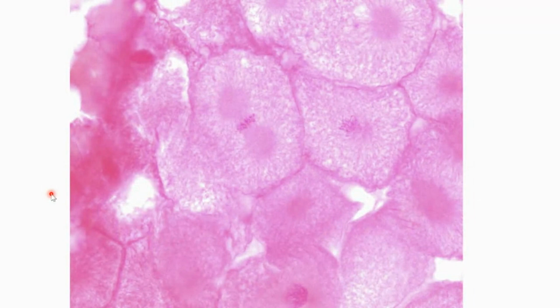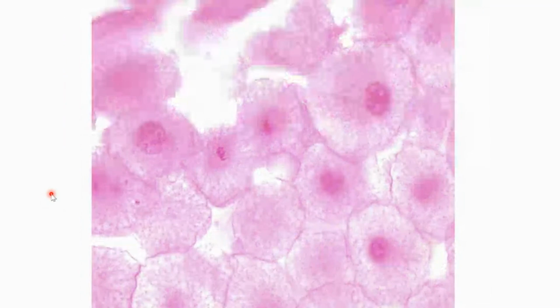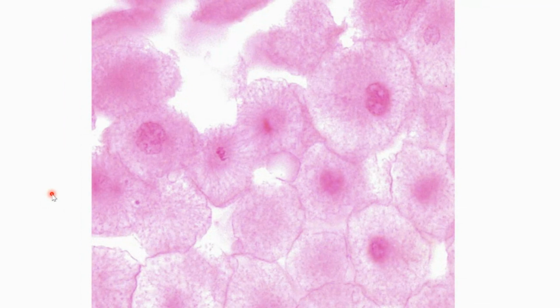Not my favorite. Also not my favorite. I know we have a really awesome telophase in here. Let me find it. Okay, check this one out. This may have been the one I used before even, I don't know. I probably was. So we have these two distinct nuclei where I have genetic information, and we can see that cleavage furrow. So here's another example for us of the process of telophase.